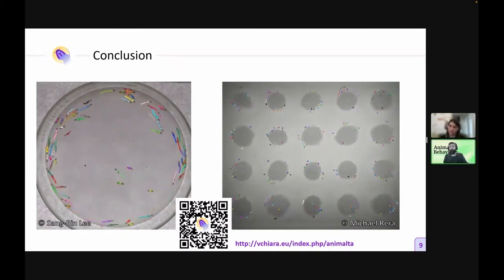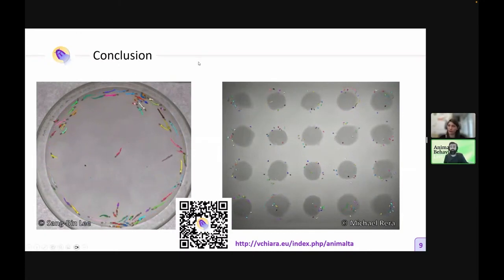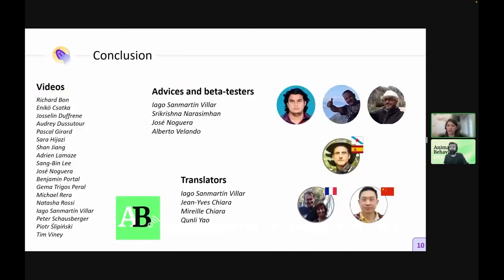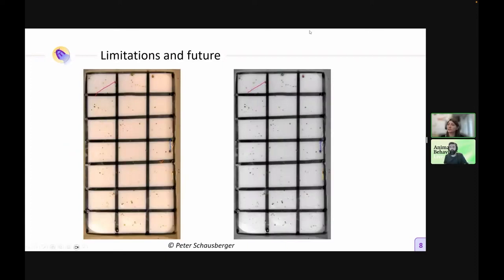And regarding these color background things, because you showed an example with a small black line, for instance, do you think that it will work with a bigger object? Yeah, sorry, it's not dependent on the object. The size and this kind of stuff are not impacted. I can take the video here.